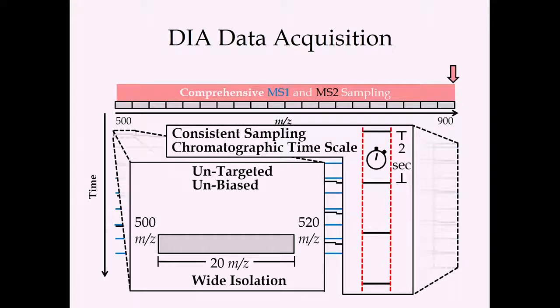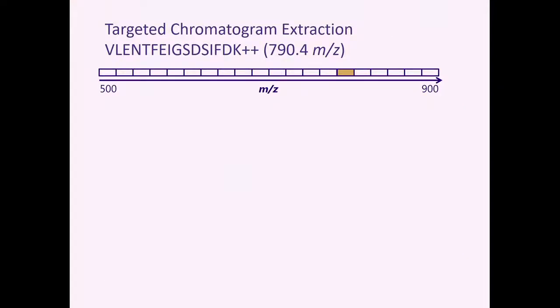Now, for me, one of the things that drew me to collecting data by data independent acquisition, because we had been collecting data independent acquisition for a very long time, going back to around 2004, 2005. One of the things that was a little different was once we started working with Skyline, we started thinking, I wonder if we could just pull out some of these individual peptides out of these data sets. And Brendan had made it so that Skyline could, in theory, do that.